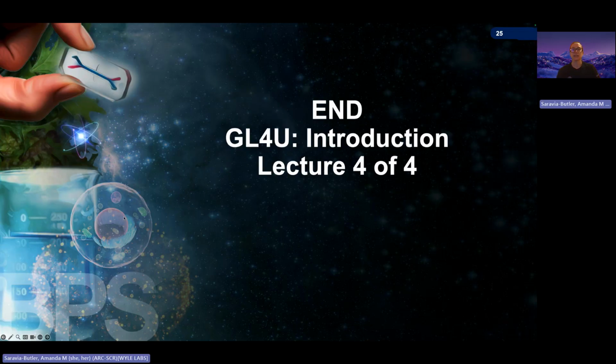This brings us to the end of the last of the 4 GL4U introduction lectures. I hope you guys learned quite a bit from these introduction lectures, including some overview of NASA, the Science Mission Directorate, space biology, the Open Science Data Repository, GeneLab. Also, hope you guys got a nice introduction to Unix commands as well as Jupyter. And then through here, I hope you guys have a little bit better idea now of how we prepare libraries for sequencing and how short read sequencing through sequencing by synthesis happens.